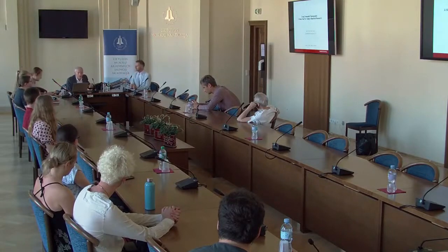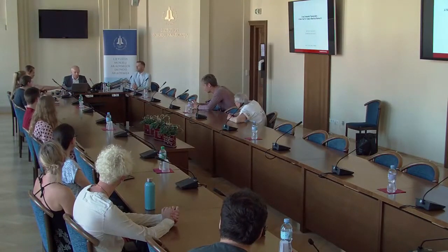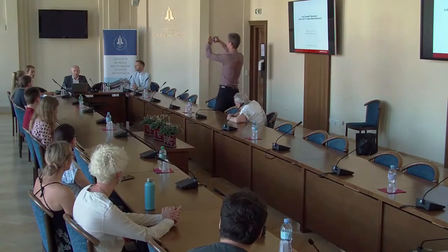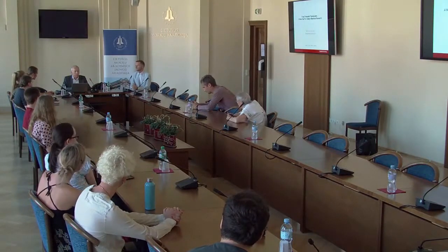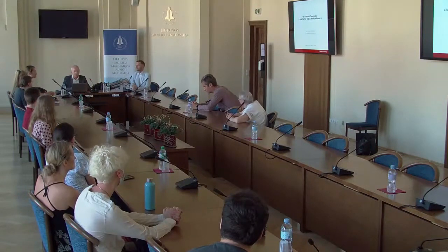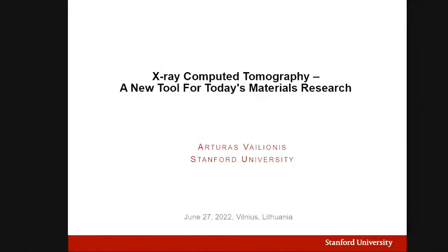Okay. Everybody hear me? Okay. Laba diena. Hello, everyone. My name is Artūras Vailionis, and I'm currently working at Stanford University, mostly managing a shared facility. My shared facility consists of X-ray diffraction instruments and also an X-ray microscopy instrument, which I will present today. You're probably familiar with X-ray diffraction, and X-ray microscopy from the medical field, where somebody does a CT, computer tomography, on you. Here we do CT on materials, with much higher resolution. That's what I would like to talk about today.